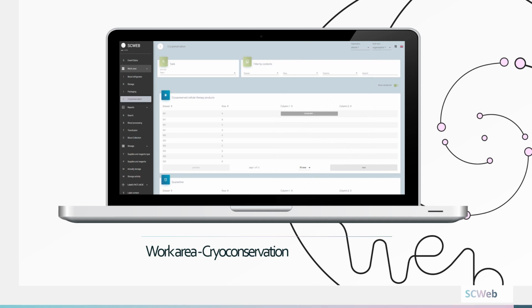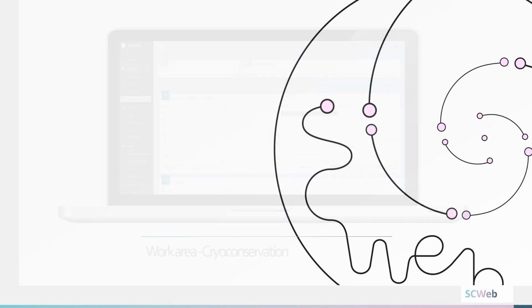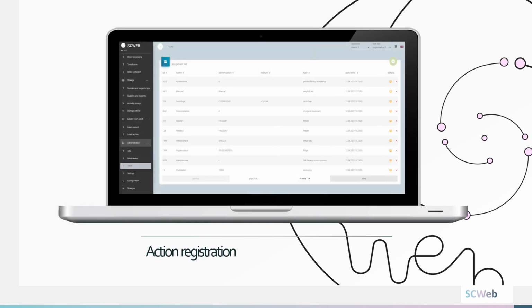Once the process is complete, we will see the position of the SEC that was introduced. It will be possible to search the unit by SEC or by name and surname. All the actions carried out in every station are promptly registered and can be verified in real time.